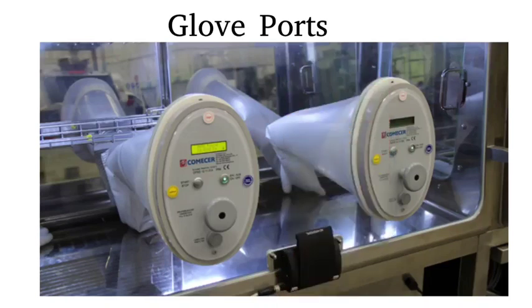Glove ports, one of the defining features of isolators. Glove ports allow operators to manipulate the equipment and materials inside the isolator without breaking containment. The gloves are typically made of materials resistant to chemicals and pathogens, such as neoprene, EPDM and chlorosulfonated polyethylene. These gloves are required to be tested for integrity before and after use in situ.